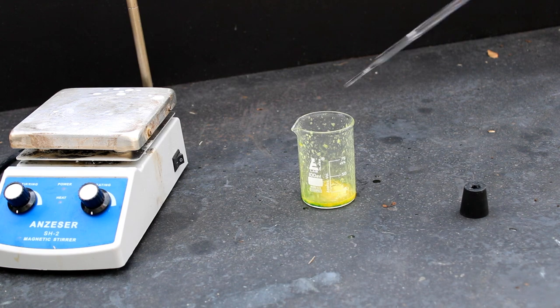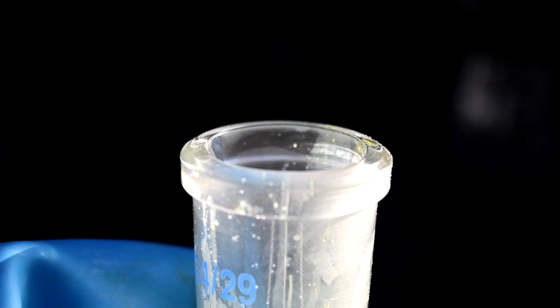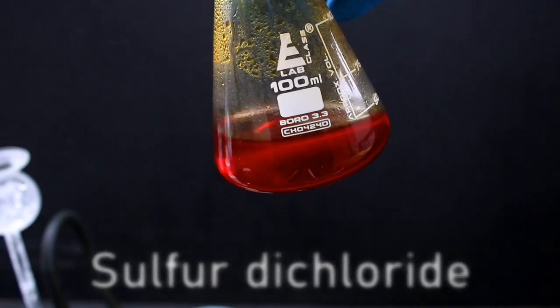A few videos back, I mentioned that chloric acid was the most unpleasant chemical I've worked with so far. Well, I regret to say that this title was promptly reassigned the moment I produced the first few drops of today's chemical, sulfur dichloride.